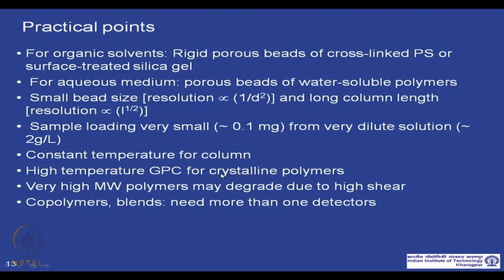High temperature GPCs are required for crystalline polymers. Crystalline polymers are not typically soluble at room temperature. So, the molecules are dissolved at a high temperature, and the column is kept at a higher temperature, and the separation is performed at that higher temperature. So, we typically use the term high temperature GPC for that.